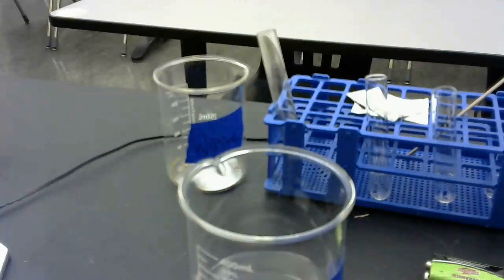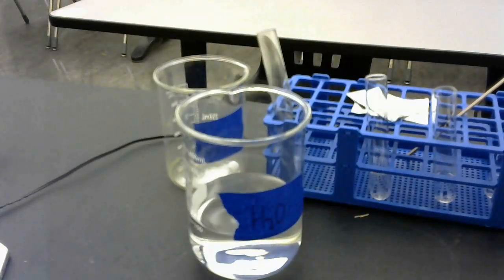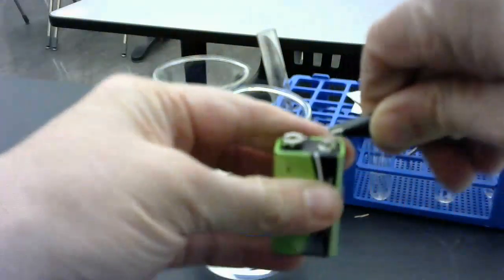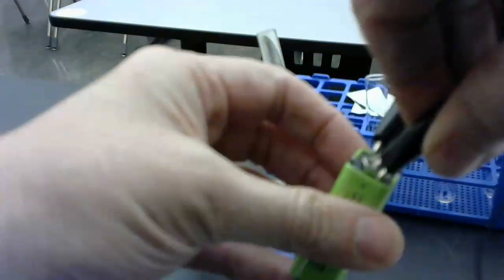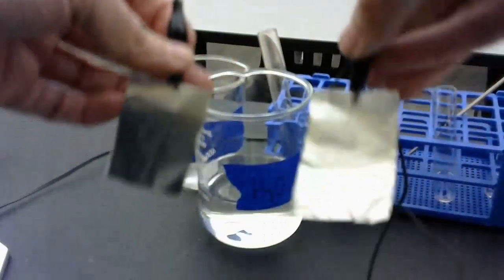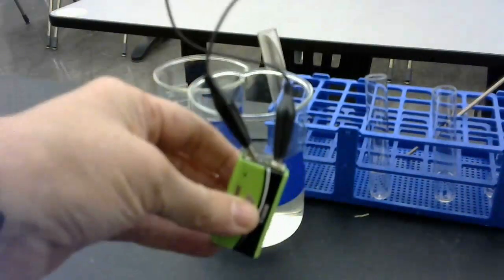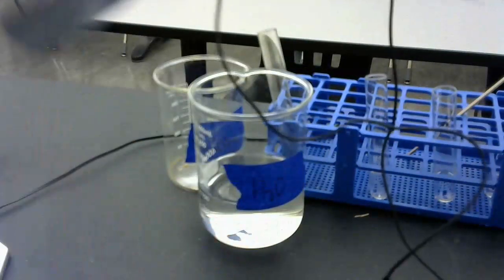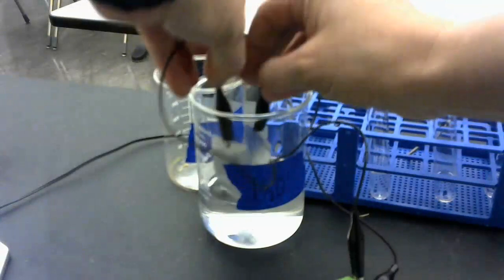And what I'm going to do with my water is I am going to also take my battery and connect my battery to my alligator clips. So I have my alligator clips right here. I have one alligator clip and then I have a second alligator clip. And what I'm going to do is connect those alligator clips. So I have an apparatus that looks like this. I have 2 pieces of aluminum foil, and the pieces of aluminum foil are connected to my battery, okay? And then I'm going to take my aluminum foil and stick it into my water.